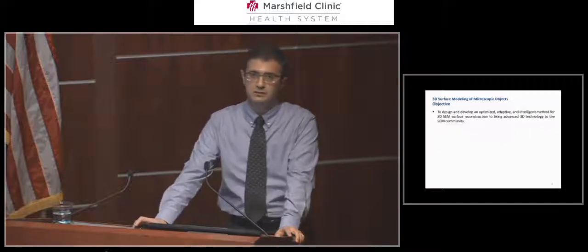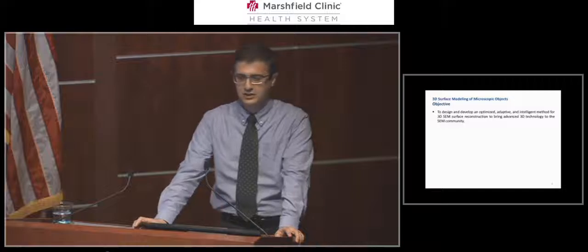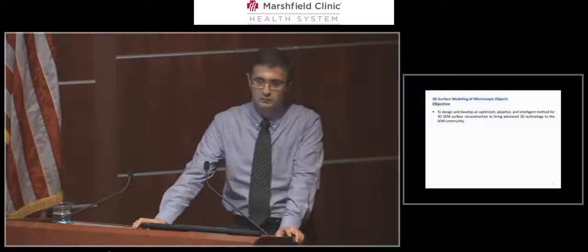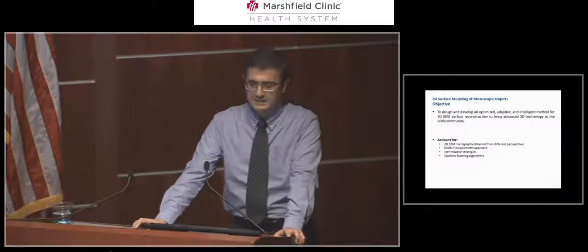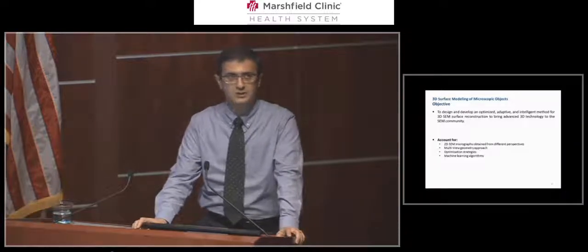The objective of the work is to design and develop an optimized, intelligent, and adaptive framework to tackle the problem of 3D SEM surface reconstruction. In doing so, we wish to account for a set of two-dimensional SEM micrographs taken from different perspectives, multi-view geometry, optimization strategies, and machine learning algorithms.